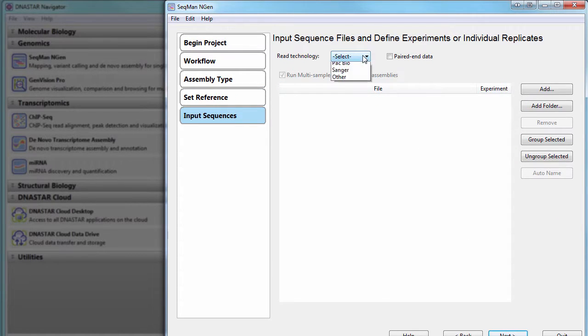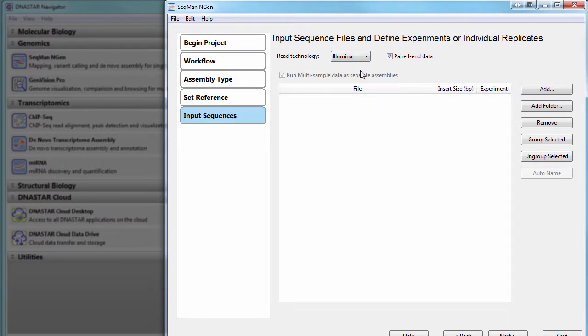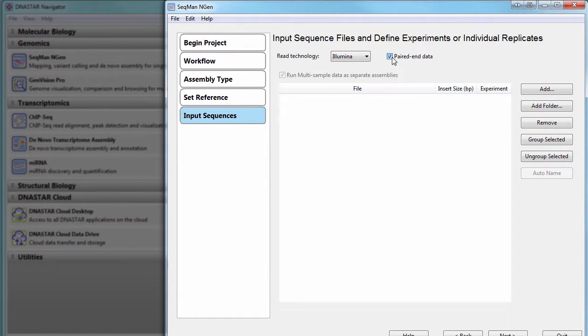Next, choose your read technology. In this case, I'll select Illumina, and I'm working with single-end data, so I'm going to uncheck this box and then add your reads.